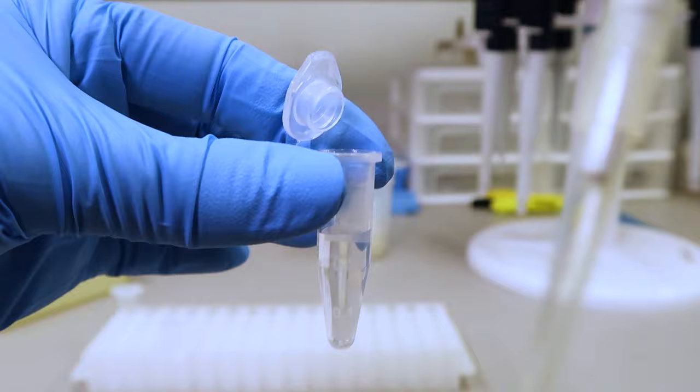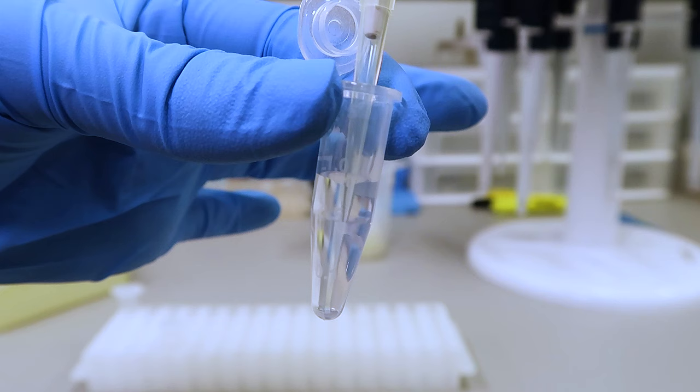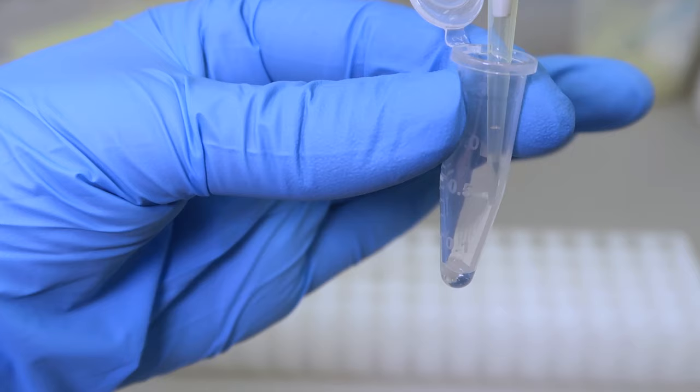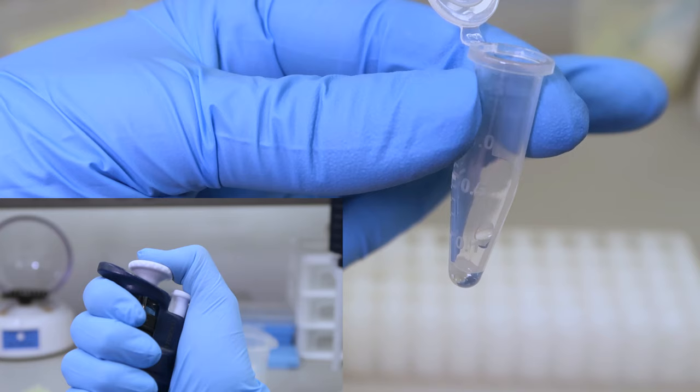To draw liquid into the pipet, push the plunger down to the first stop. Then, place the pipet tip into the liquid and release the plunger slowly. This will draw the correct volume of liquid into your tip. To dispense into a new tube, touch the pipet tip to the bottom or side wall of the tube and push the plunger down past the first stop until you feel the second stop. Pull your pipet tip away before releasing the plunger to ensure that the liquid is not drawn back up into the pipet.